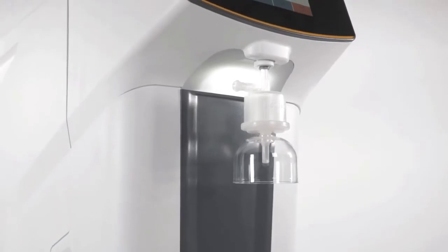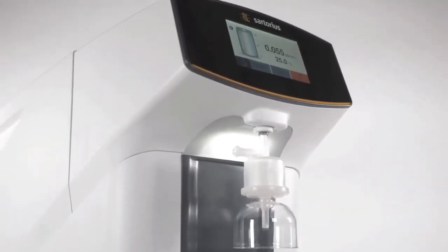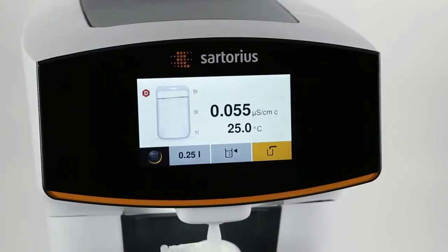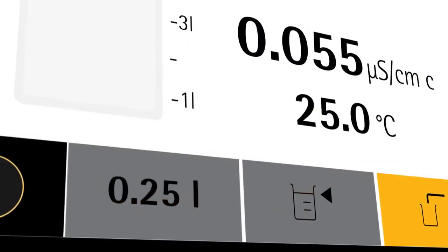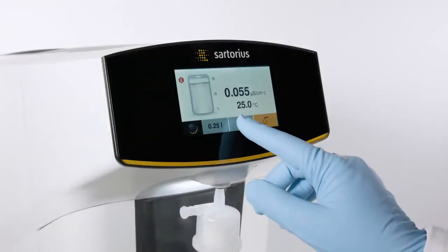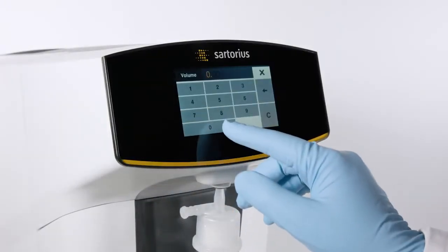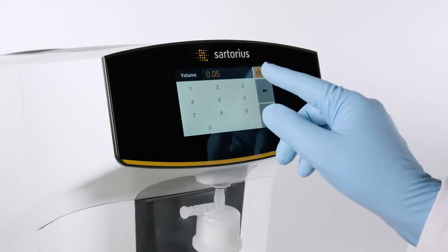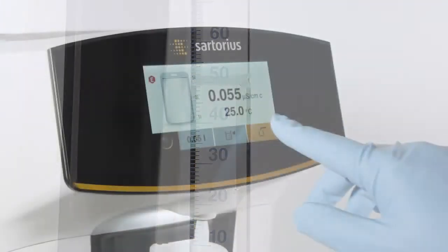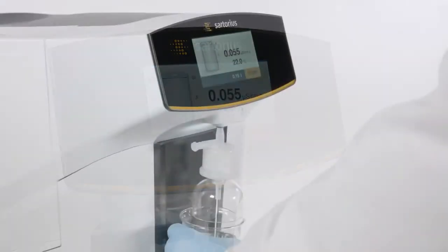The next-generation intuitive user interface makes your lab life easier as well. The large display shows you all relevant information and all three dispensing options at a glance. Volume-controlled dispensing enables you to enter desired volumes, while the favorites function remembers the last amount defined for recurrent dispensing of identical volumes. Or you can choose manual dispensing if you need different amounts.